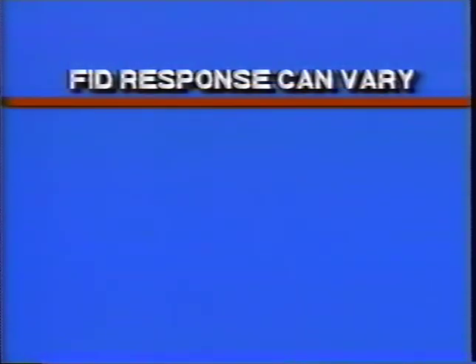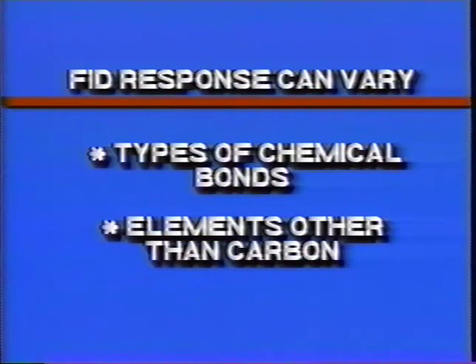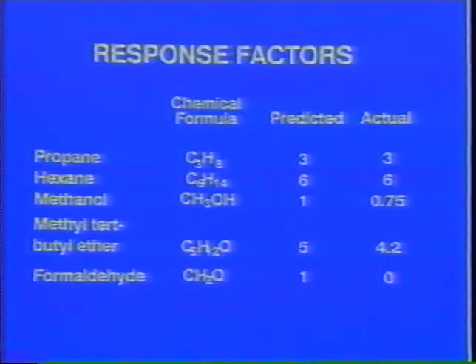But the FID response can vary from compound to compound because of other factors, including the types of chemical bonds between atoms and the elements other than carbon present in the organic molecules. For example, the table presented here contains some experimentally derived response factors for FIDs. These figures should not be considered as absolute values because in practice, response factors vary with many parameters, including the type of FID being used.